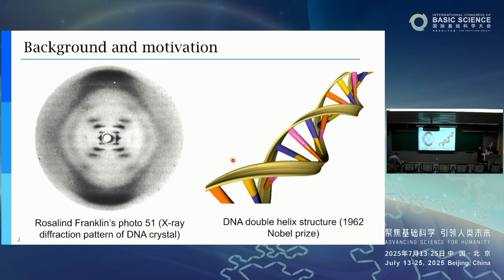So in this talk, I want to convince you that by using this ptychography technology, we don't need to infer the structure. We don't need to try to figure out the structure. We can directly image the specimen. You don't need to think about what will be the best structure to generate this image. You can directly recover this double helix image based on this diffraction pattern. So that is the motivation here.